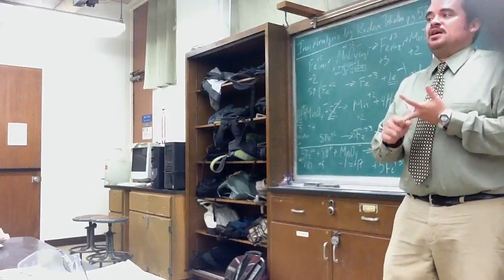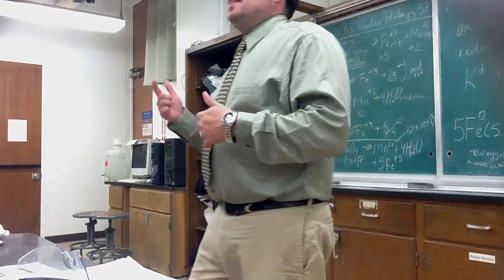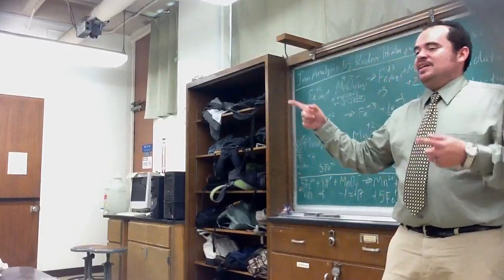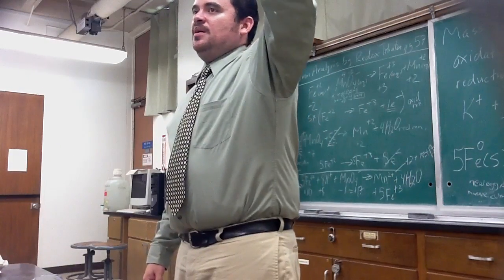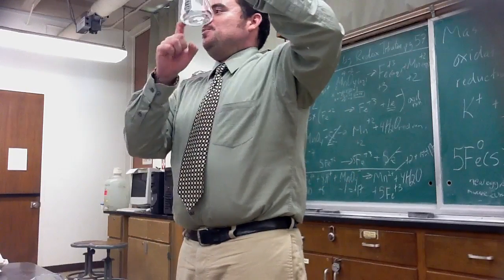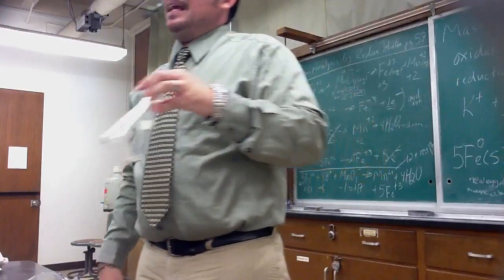on your skin or turn it brown. Paper, same thing. Sulfuric acid is also considered an oxidizing agent. That is why we do not want you to add that to the iron 2 complex that we actually laid out. Because if you do this and it's already reacting here, then you're going to see the reaction over here because it's attacking, not the potassium permanganate.